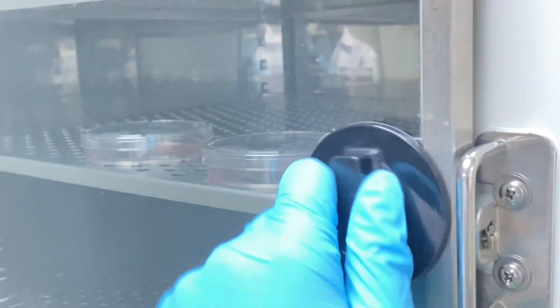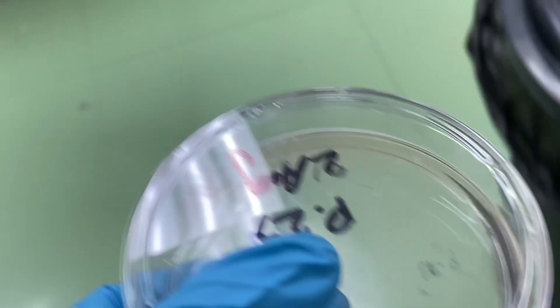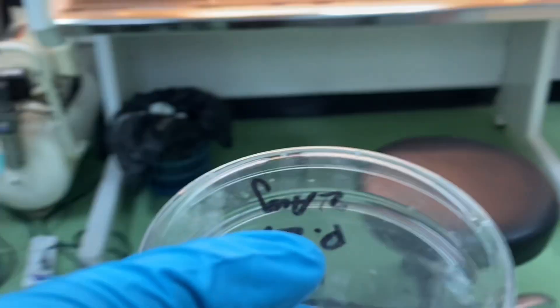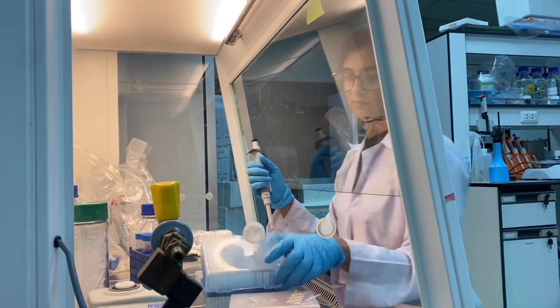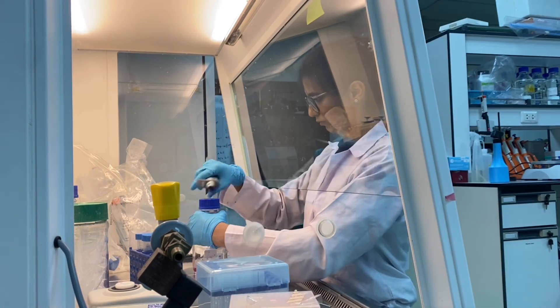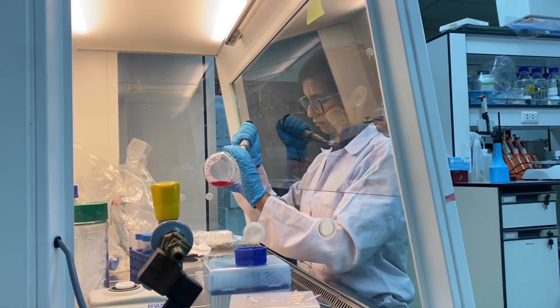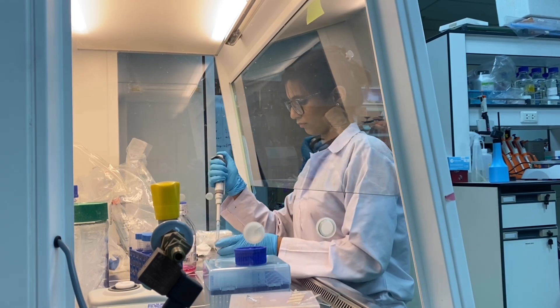Now it's time to take out my plates from the incubator because it's already been five minutes. After checking them under the microscope, I confirmed that the cells have already been detached from the bottom. To stop the action of trypsin, I'm going to add 2 ml of full media into the plates — that will stop the trypsin process.